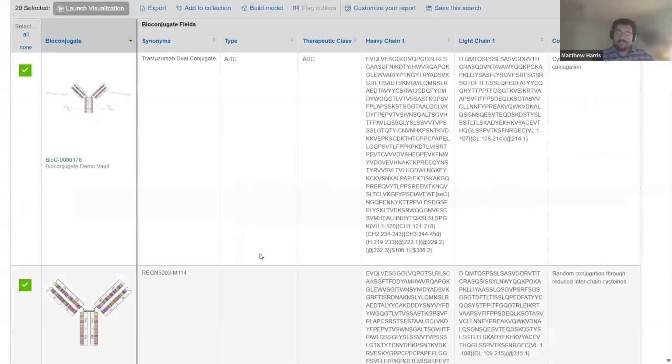So, with that, I can wrap up the biologics registration updates here with CDD Vault. We've looked at the new macromolecule editor, and the latest registration features for cyclic peptides, antibodies, and ADCs. This is all designed to make it easier to capture and work with these complex biomolecules here within CDD Vault. Thank you so much for joining, and if you have any questions, feel free to reach out, and we're always here to help you along the way.